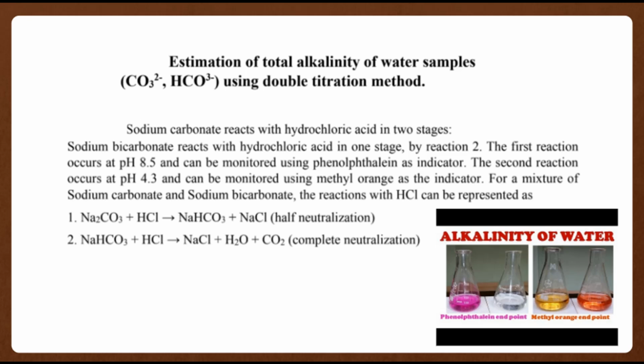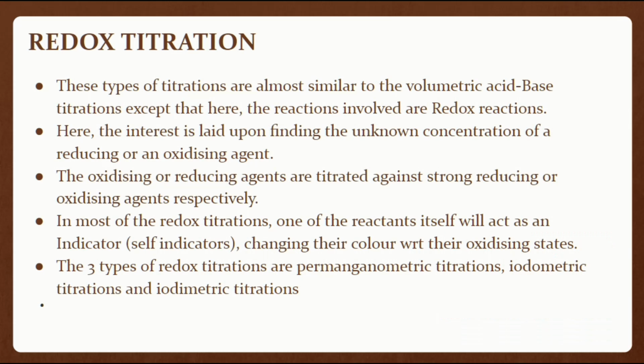To this colorless solution obtained, 2 to 3 drops of methyl orange indicator is added. The yellow solution obtained is titrated against the standard HCl in the burette until it turns reddish orange. The burette reading is noted again and is marked as T2. This two-step titration is repeated again for concordant value.